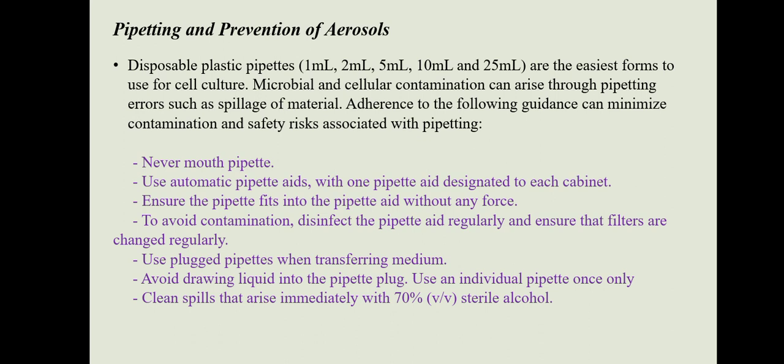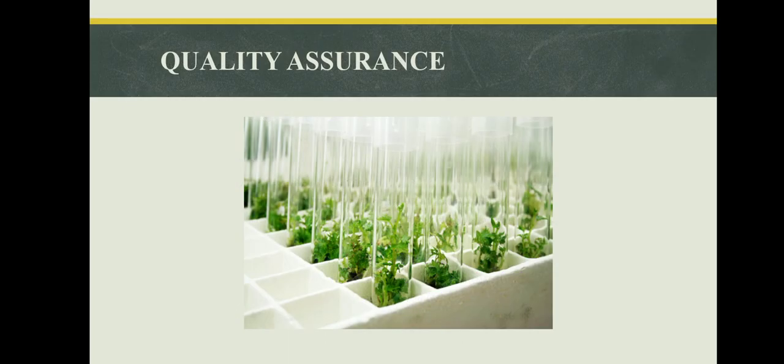To avoid contamination, disinfect the pipette aid regularly and ensure that filters are changed regularly. Use plugged pipettes when transferring medium. Avoid drawing liquid into the pipette plug. Use an individual pipette once only. Clean spills that arise immediately with 70% V/V sterile alcohol.